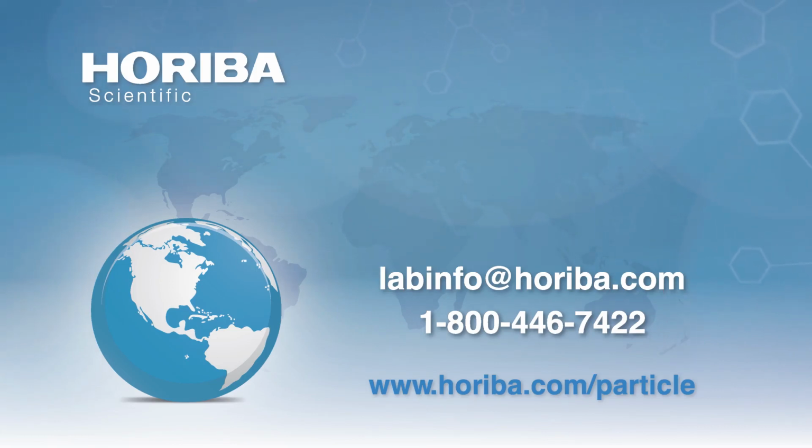So if you're loading onto, let's say, some type of substrate, maybe an API particle where you're layering on various controlled release coatings, or perhaps an ion exchange resin particle where you're layering on a certain amount of coating, yes, it can be used in that way. Now, of course, the accuracy improves as I mentioned with the critical quality attributes, so the particle size distribution and sphericity. As the sphericity goes up, the accuracy of the computational design tool will improve.